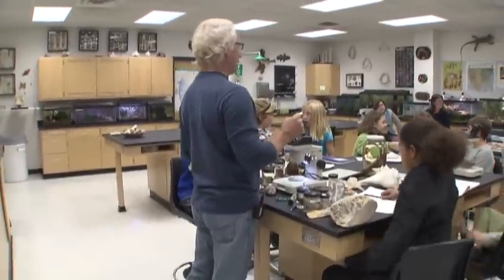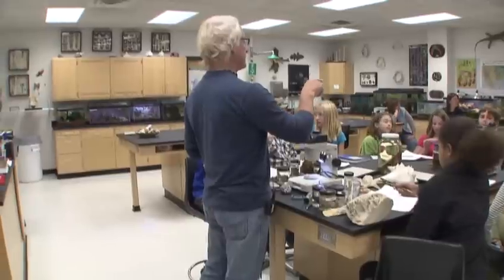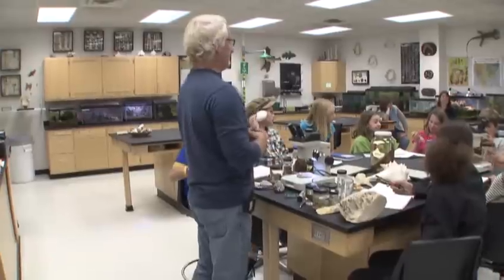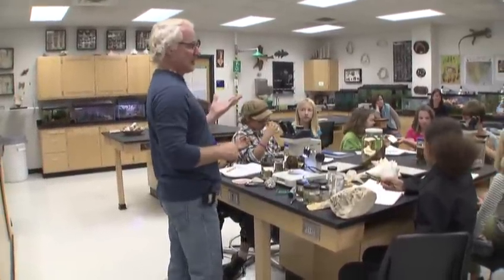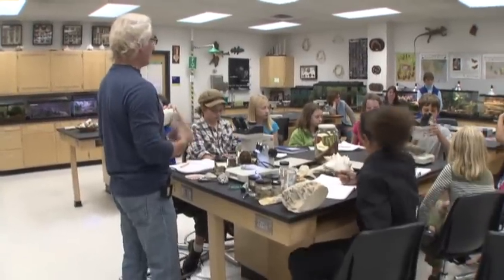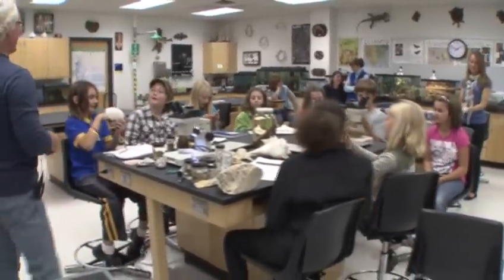because I'm afraid we'll run out of time otherwise. And Courtney, would you like to cut the clam apart for us, and I'll do part of the squid? Or we can switch, it doesn't matter. Okay. So we're going to go around the table here now, you guys, and we're going to take apart some bivalves that are freshwater, and we're going to take apart a squid from Lee's Market, okay?